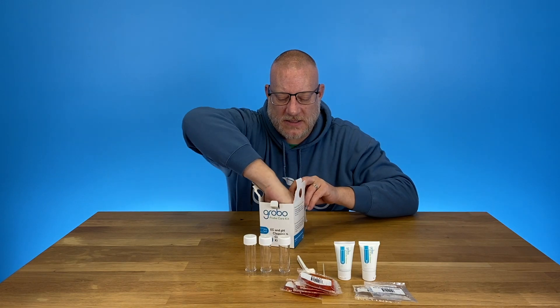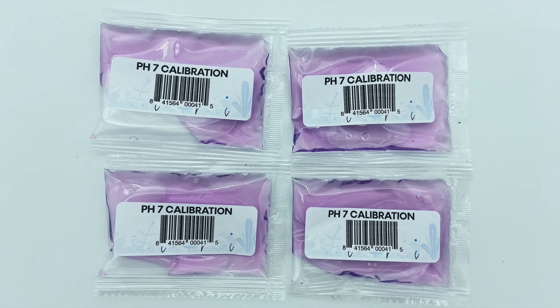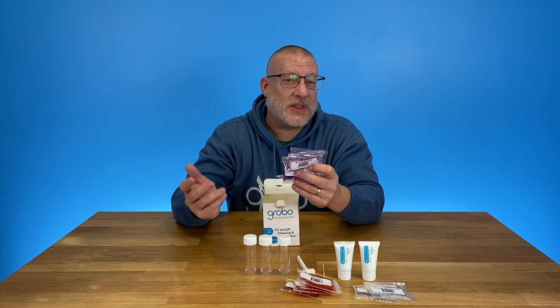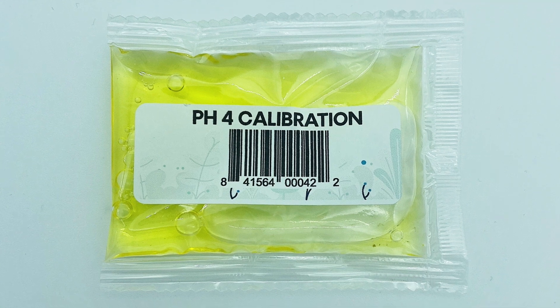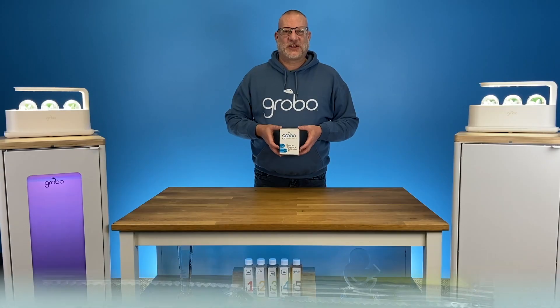I've also got calibration solutions for your pH probe. Each of these comes with four packets so you can calibrate four times. I like to calibrate usually monthly, but at least at the end of every grow. Then you calibrate your pH probe to 4.0, and we've got four of these ones too.